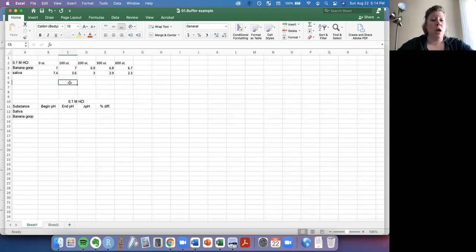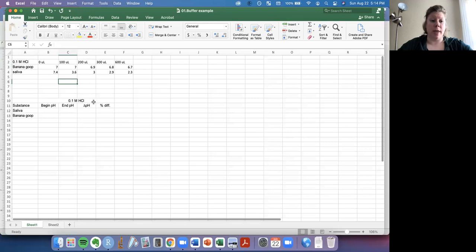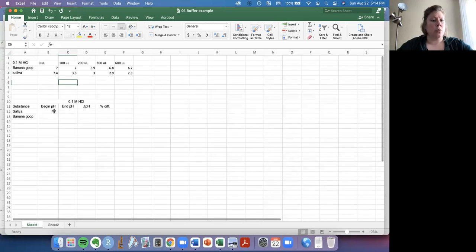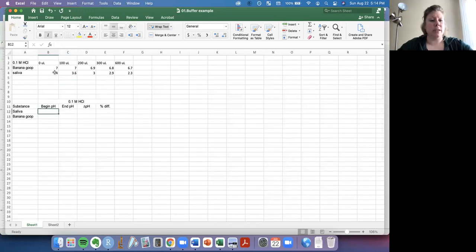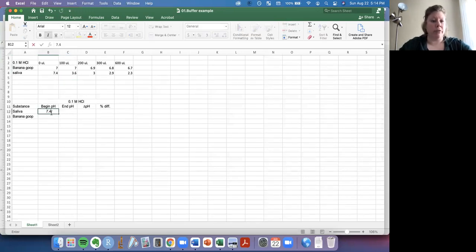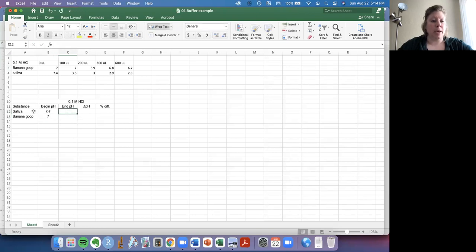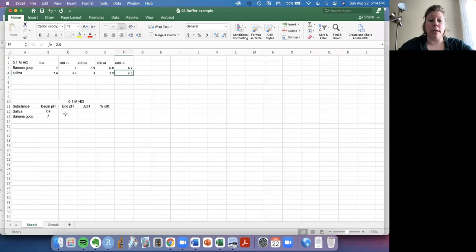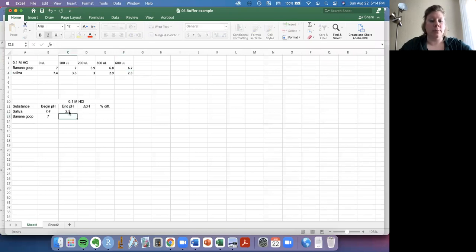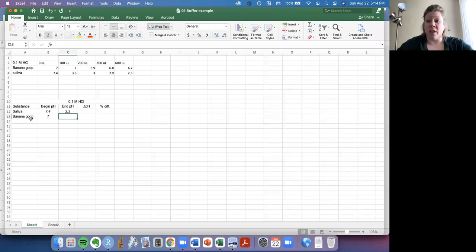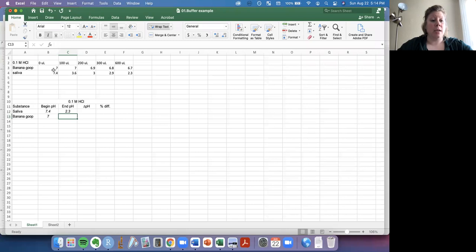So the first thing I want to do is make a table about that. So with saliva, I'm going to look first at our beginning pH, there's 7.4. For the banana goop, our beginning pH was 7. The end pH for saliva up here was 2.3. So I'm going to enter that in right here. I've just made this little table up by typing it into Excel. And for banana goop, our ending pH at the max addition of HCl is 6.7.